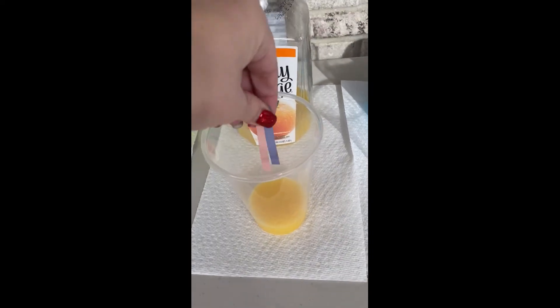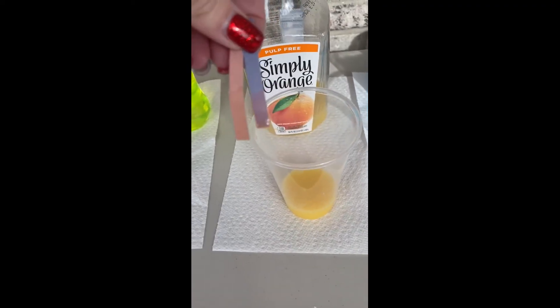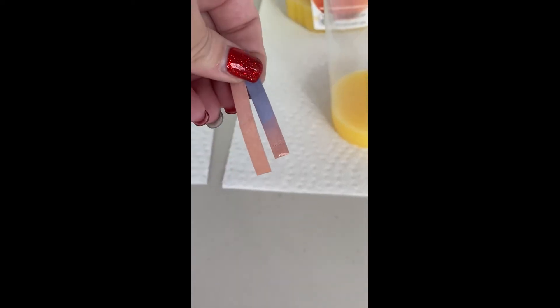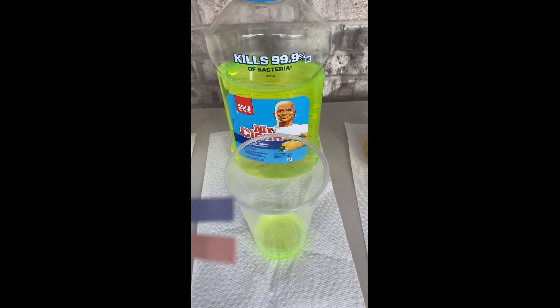Orange juice is up next. Go ahead and test the sample. You can see that our blue litmus paper turned a light shade of pink or red, therefore it is an acid, but not a strong one.